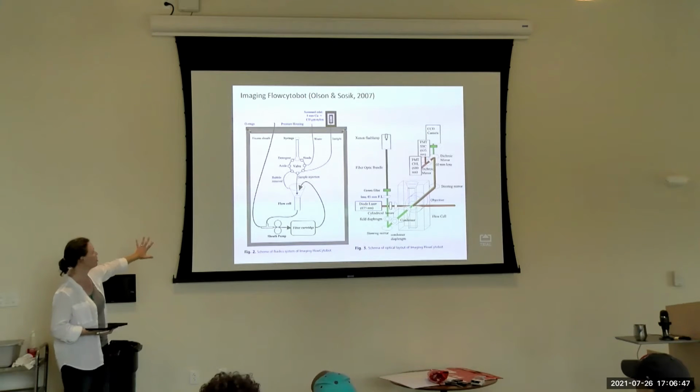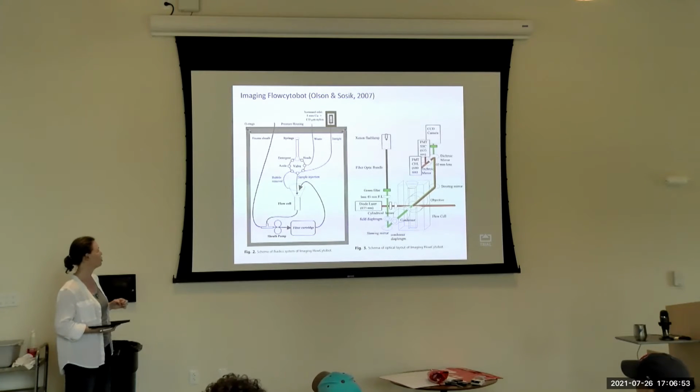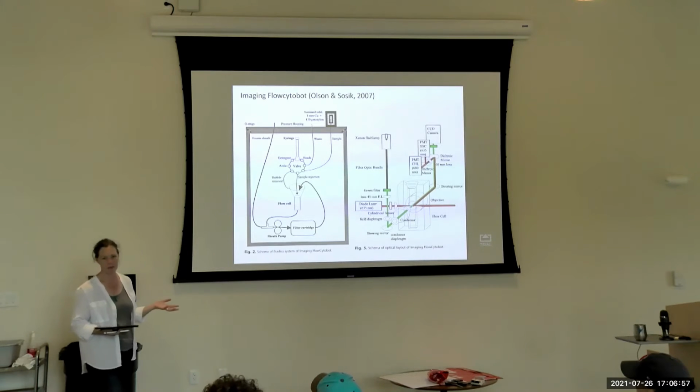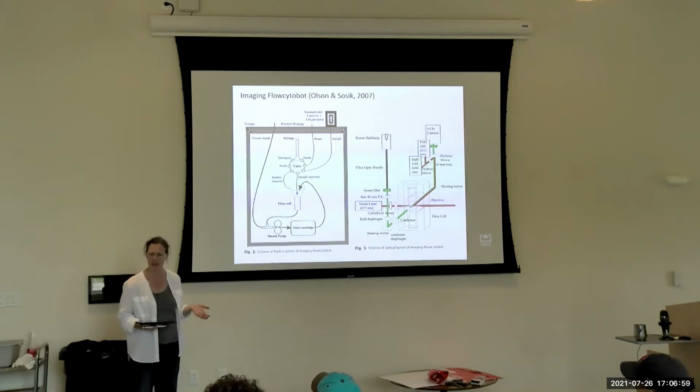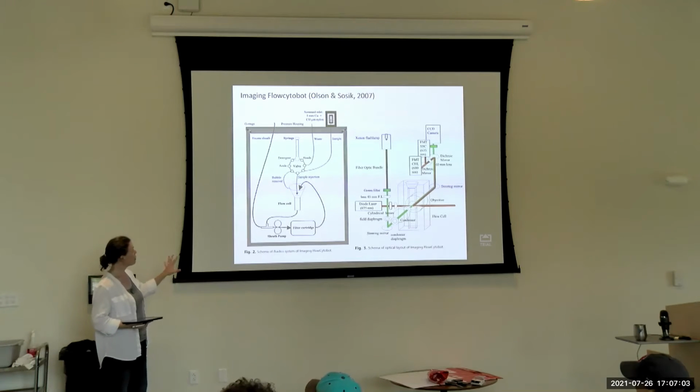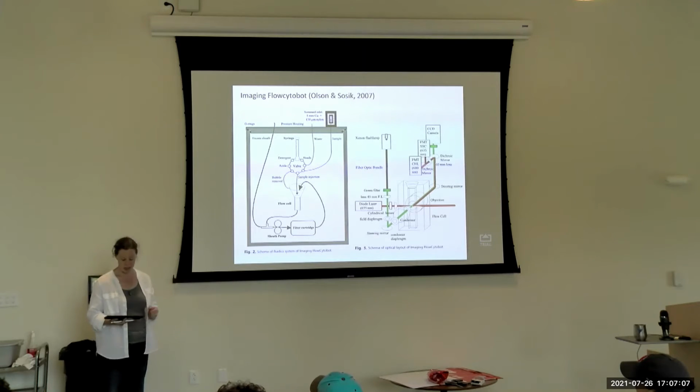But these two figures just demonstrate the principles, basically the configuration of the instrument and what it's doing. It's a flow cytometer based on flow cytometers that originally were invented for medical use, sorting blood cells. But it's been adapted for sorting plankton cells in situ and also imaging them.